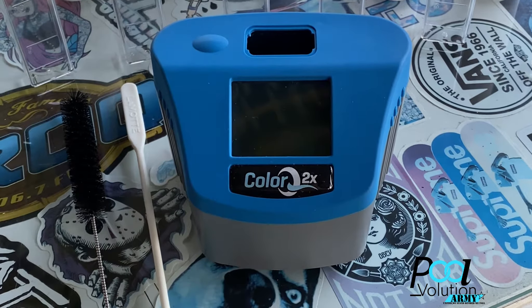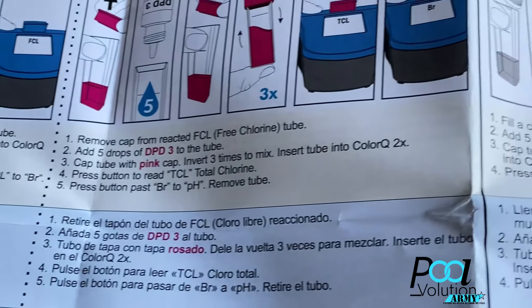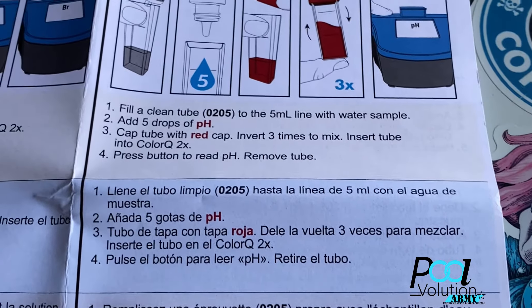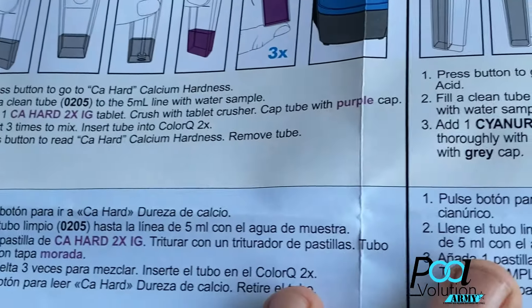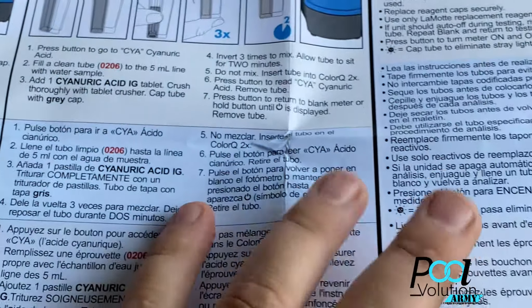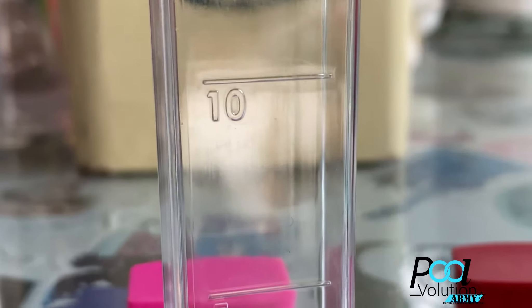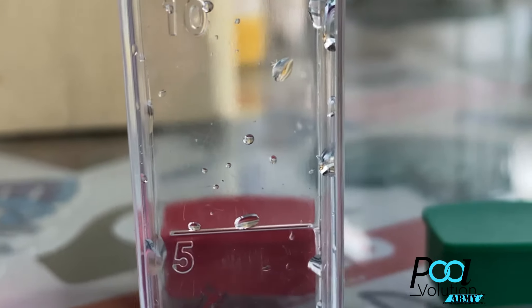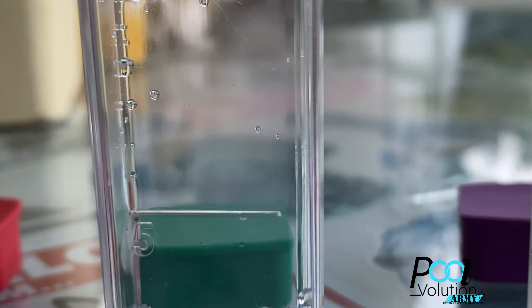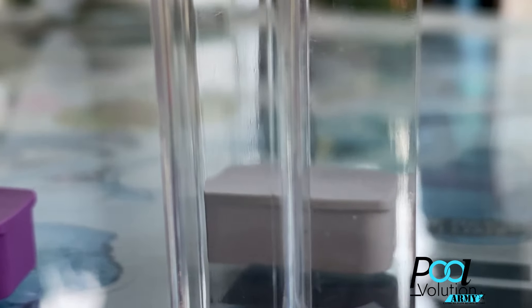The directions are a lot similar to the older generation, other than there are a couple more tablets and reagents to use. The directions are really easy — basically step 1, 2, 3, 4, 5, 6 and so forth. They give you pictures and writing, which makes it a lot easier. The blue vial is going to be your blank — always keep that free and dry. That's for free chlorine and total chlorine. Red is for pH. Green is for total alkalinity. Purple is for calcium hardness. Gray is for cyanuric acid.